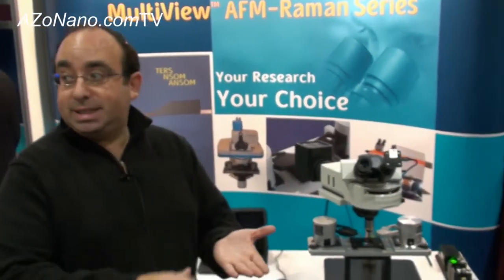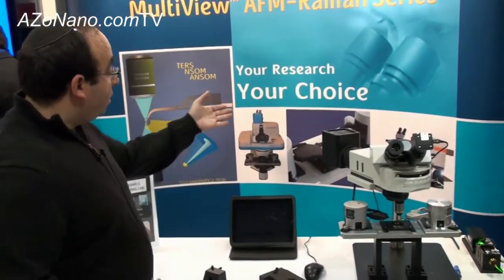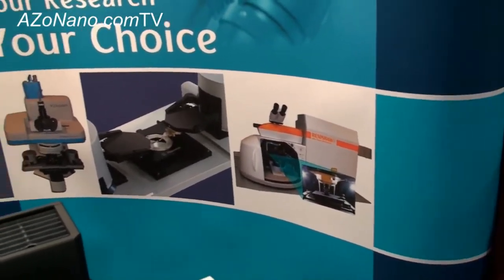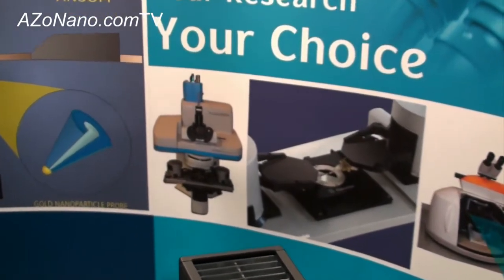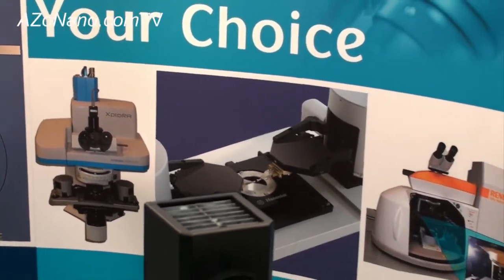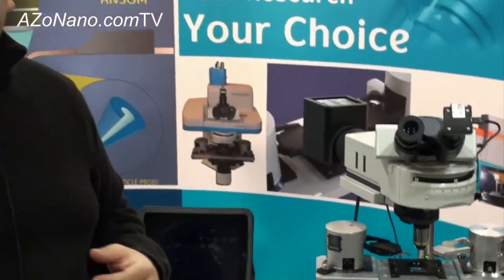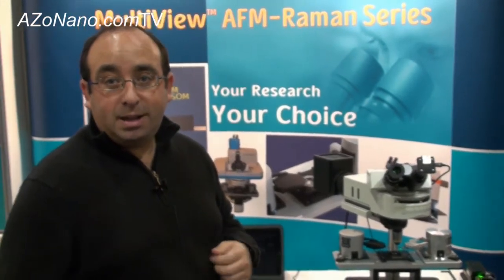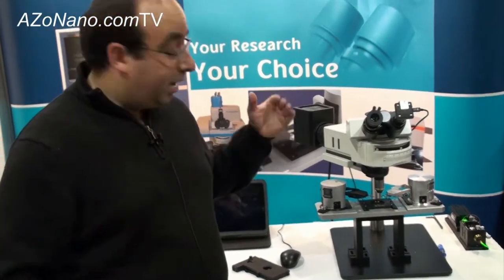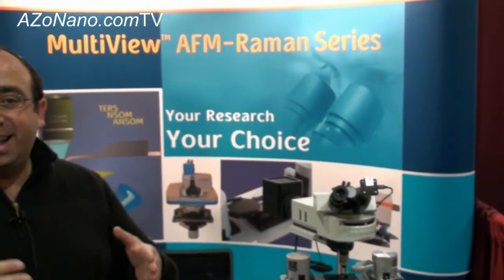The MultiView 4000 and MultiView 2000 are tip and sample scanning systems, so you can move the tip to find the best position for tip enhancement, then hold that position and scan the sample to get a combined AFM Raman. We're seeing here a combination of the system with the Renishaw system and another picture with the JY Explorer. We have many of these systems installed across the world, and the area of tip-enhanced Raman is where a lot of work is being done. This system allows you to do it easily and quickly.